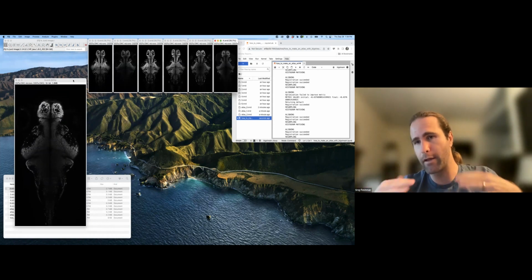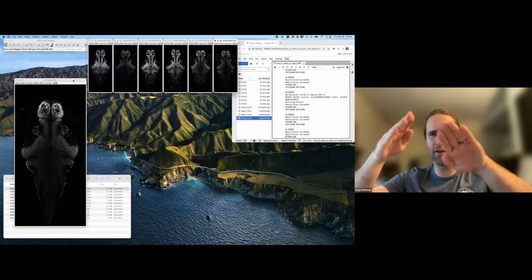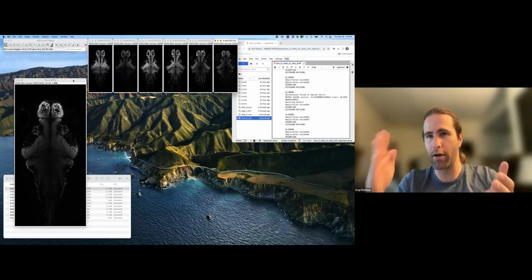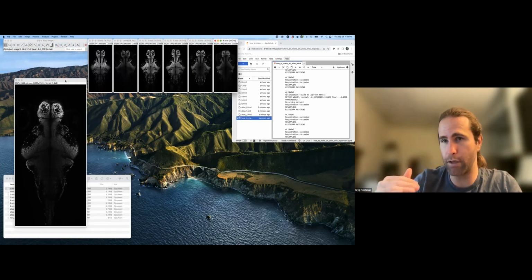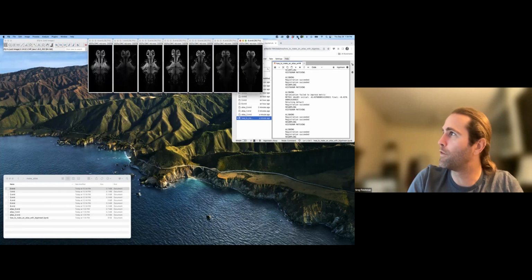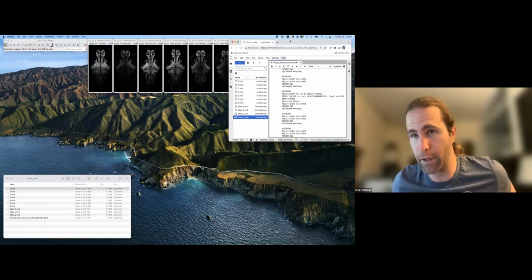I mean, that's part of the atlas construction, right? But because I wanted 2D data and initially my fish are kind of all over because they're small and they're embedded in agarose, and the embedding is kind of hard, and so they settle in different orientations. And so the 3D images were rigid aligned, and then I cut the same slice out of all of them first. Nice, thanks. Yeah, that's a demonstration-purposes-only thing to do. You wouldn't have to do that on your own data set if you were doing it in 3D.